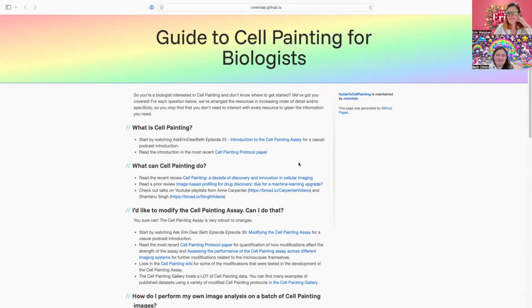So that is the overview of this resource of resources. I really like that it's got things for a whole bunch of different levels. Some people are text people and some people are video people, and it's got something for everybody here. It's really great. There are a lot of resources for how to get started doing Cell Painting. And if it's not clear to watchers of the podcast by now, we love helping people.